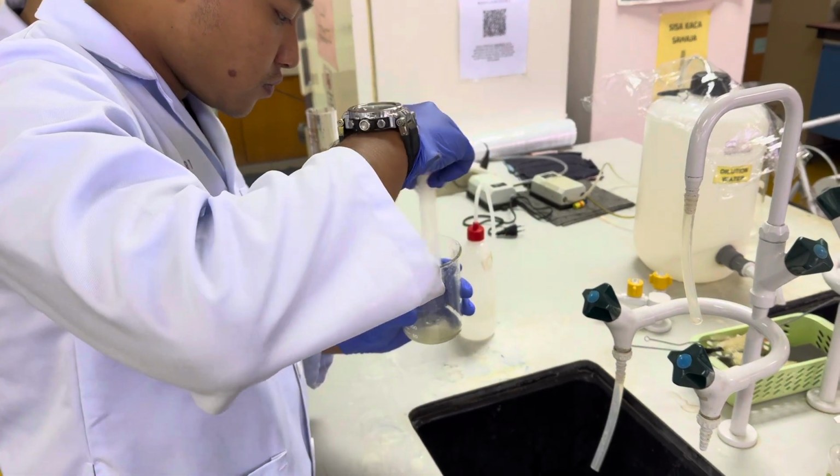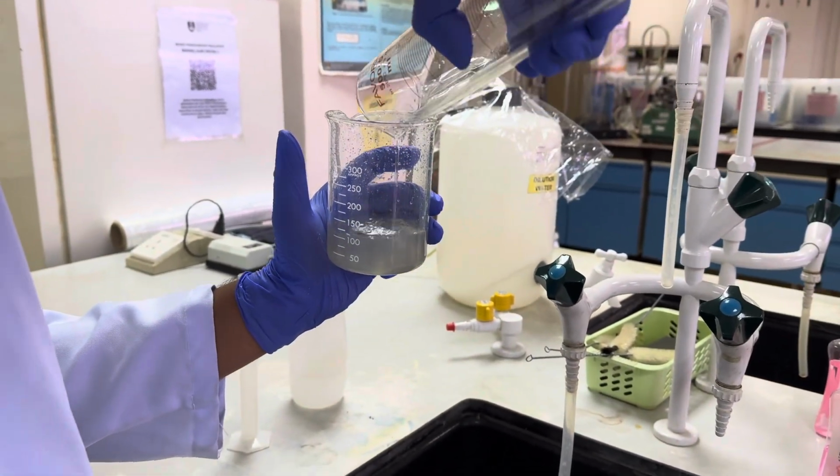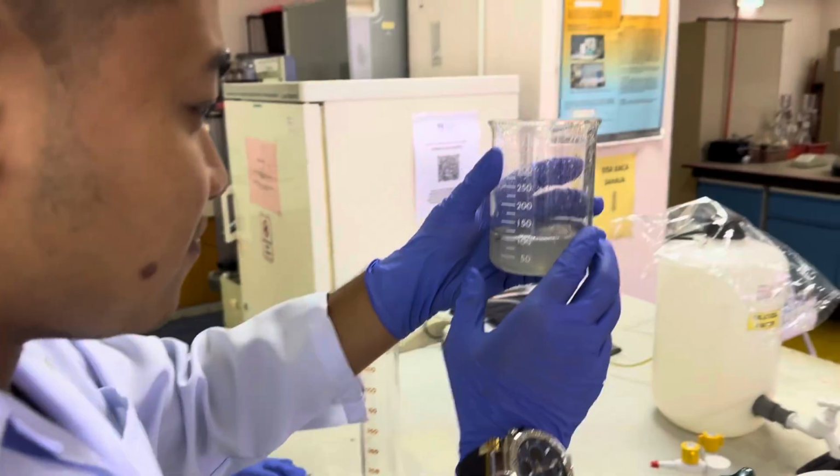Before carrying out the test, we had to dilute our water because it was too contaminated. The ratio we used was 1:10 ratio.